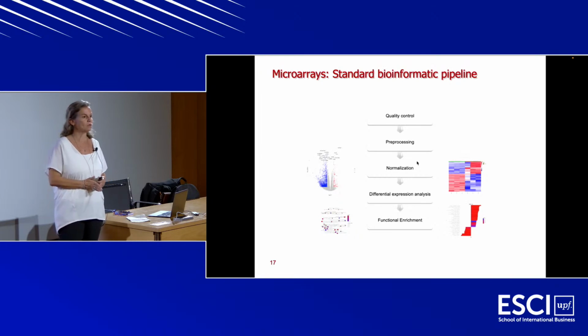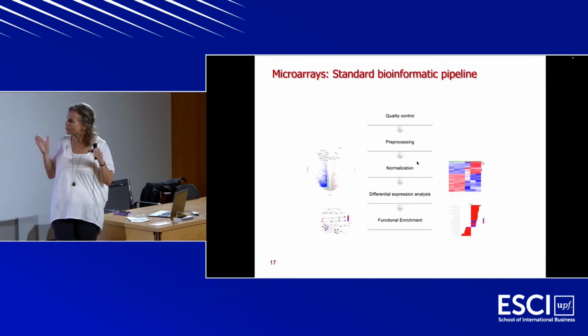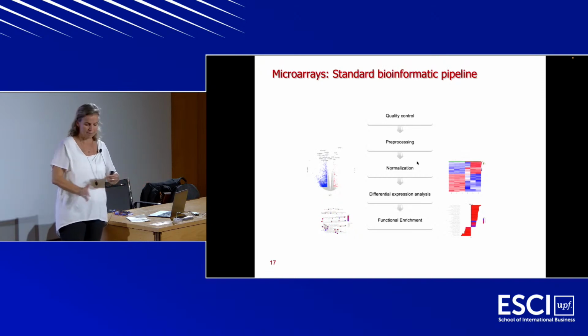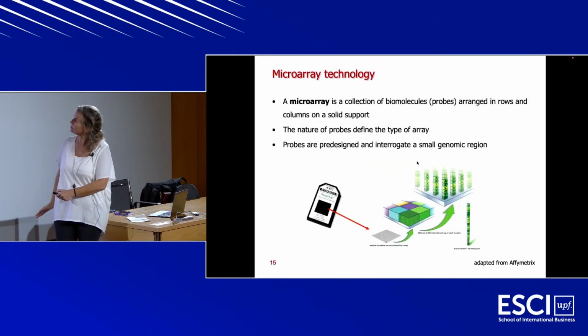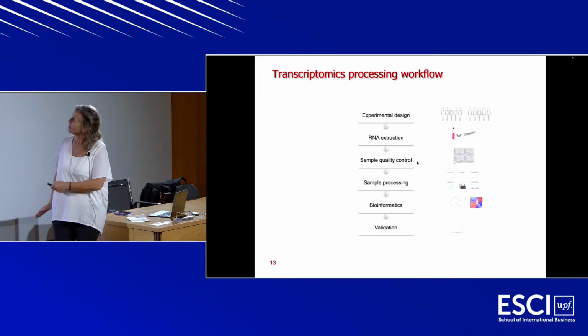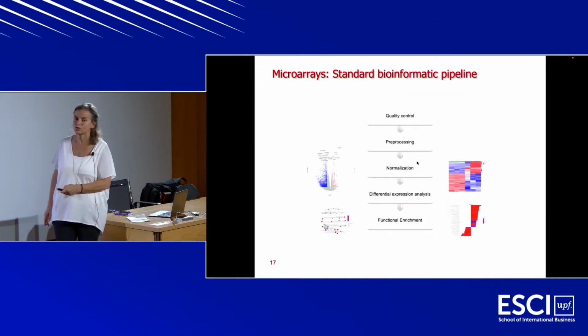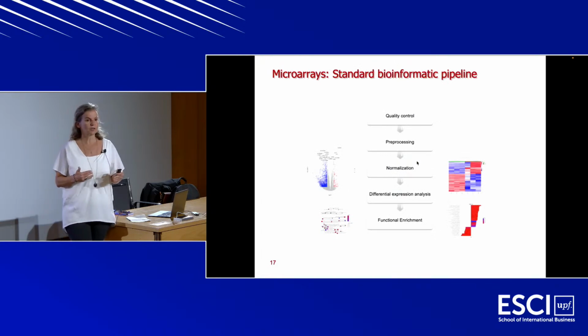And this is what I talked about, the comparison analysis. In transcriptomics, we always compare different conditions. And the goal is to perform differential expression analysis. That means that we are going to compare the microarrays of the tumoral samples that we had here, so we are going to compare the microarrays of these 5 cancer tumors and 5 normal samples. And we are interested in the profile of those cancer samples, because we want to know what's going on in this biology, what's happening in these cancer samples. So this is the differential expression analysis that is performed here.